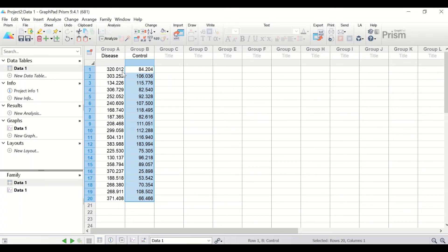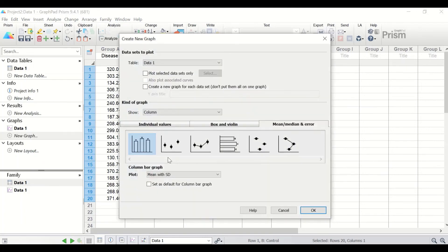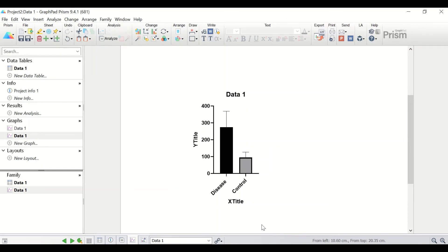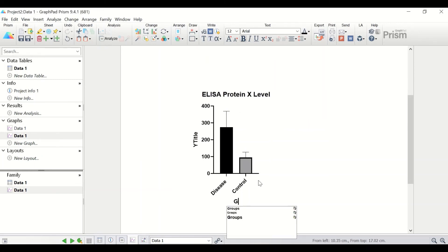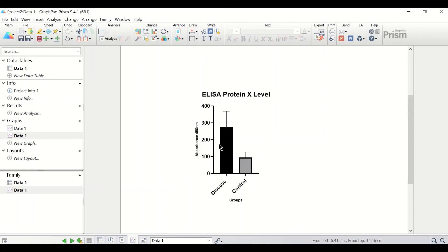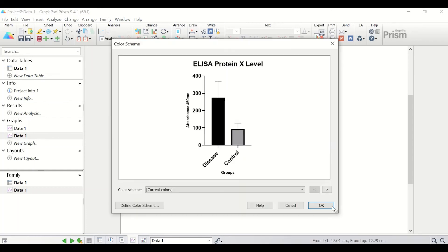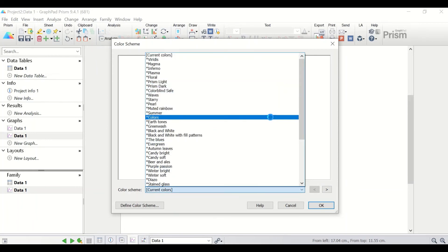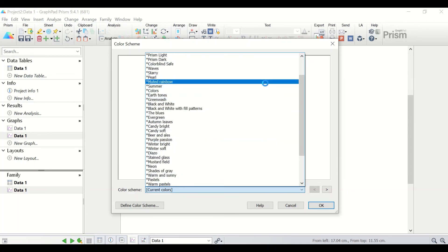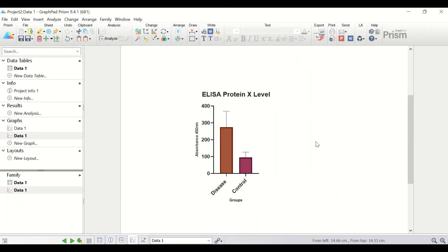To draw a bar chart, click on New Graph and select the bar chart option, then click OK. A bar chart is produced. Add a title and label the X axis as 'Groups' and the Y axis as 'Concentration.' We can also change the color of the bars by right-clicking, selecting 'Choose Color Scheme,' then 'More Color Schemes,' scrolling down to 'Muted Rainbow,' clicking on it, and clicking OK. The graph shows a clear difference between the disease and control, with protein levels being very high in the disease group compared to the control.